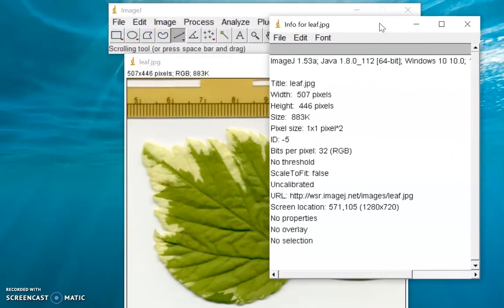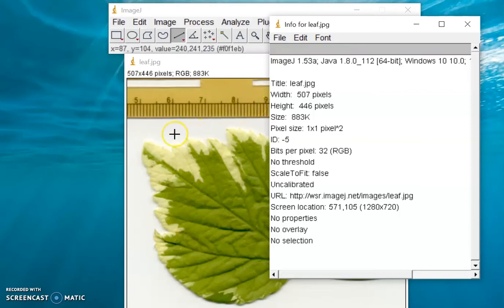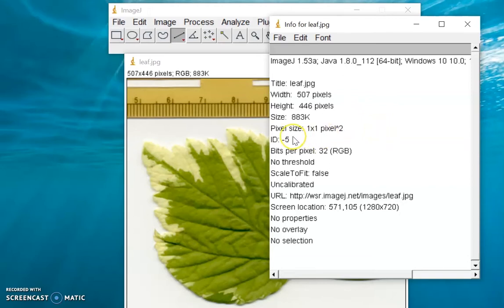So when we say metadata, this is the data associated with an image rather than coded by the image itself. This might include the algorithm that created the image, dates and time, and most importantly for quantitative image analysis, it includes the scaling of the image such as the pixel intensity, resolution, and region. We can see here that the pixel size for this image is one by one square pixel.